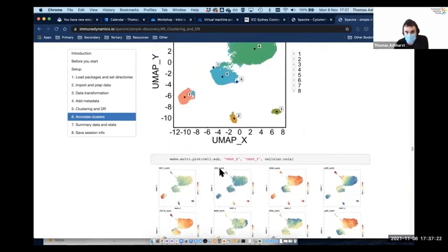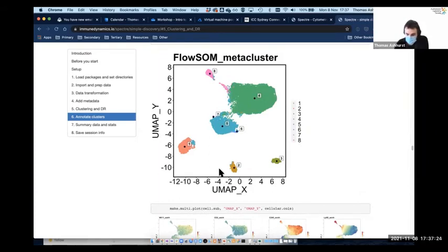The nice thing here is that every cell gets a label. So even if we come across a cell type where we're like, I have no idea what that is, or I don't know what to call that, we can still give it a label. We could call it unknown, or we could just leave it as the cluster number. It doesn't really matter. We get to call it something, so that way we can still quantify it, even if we don't have a great idea of exactly what it represents.